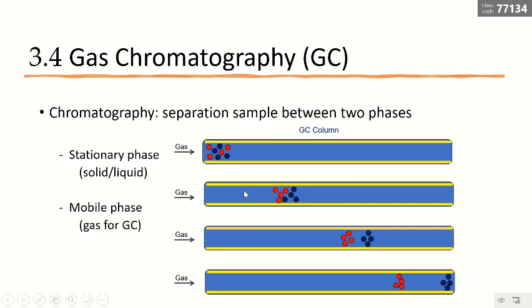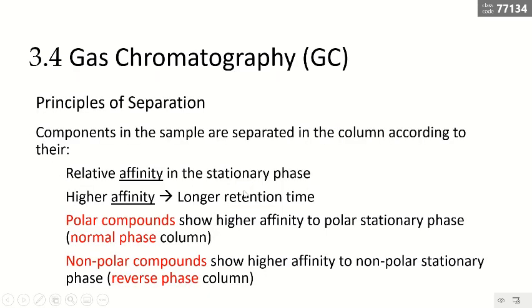We are going to explain chromatography further, using the words from just now. In the example, the components are people, me and you, who runs faster. The components mean each compound. They are going to separate according to something different. For example, you are faster, your legs are longer than mine, or you have better stamina, or your muscles are stronger. That is according to something. What is something? The stationary phase, the mobile phase, or something else. We talk about them one by one.